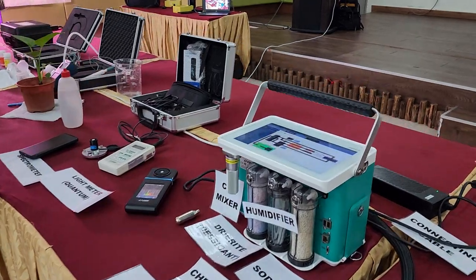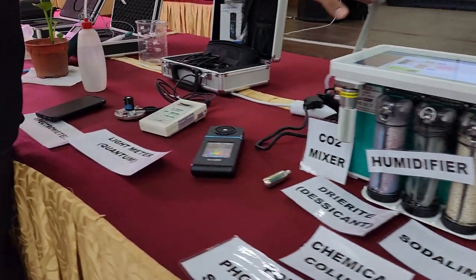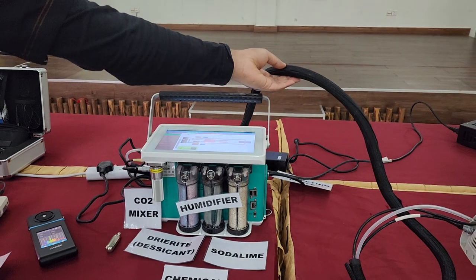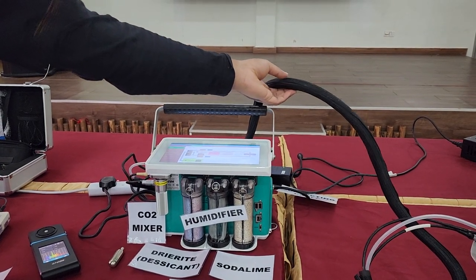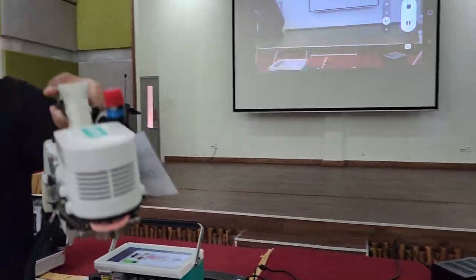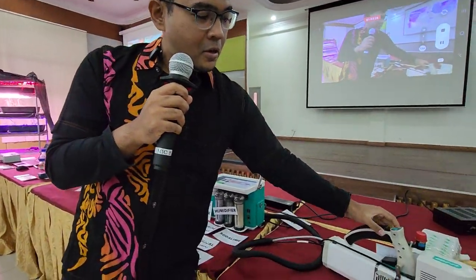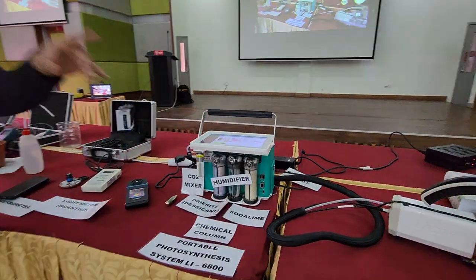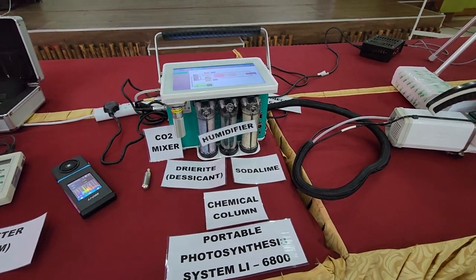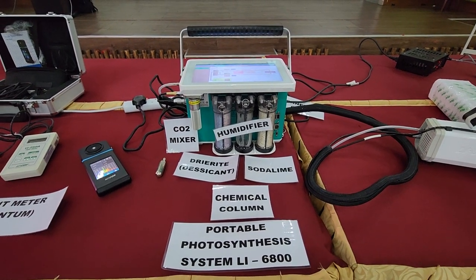So this machine has three important parts: the console, the connecting cables, and this is not just electrical cables, this is also gas cable and signal cable, and then the measuring chamber, this thing here. Not a gun. The console is the computer for the machine. This is where you control what to measure, what to record, and so on. And how you want the plants to experience.